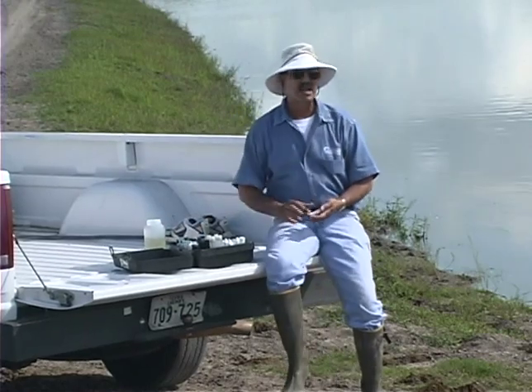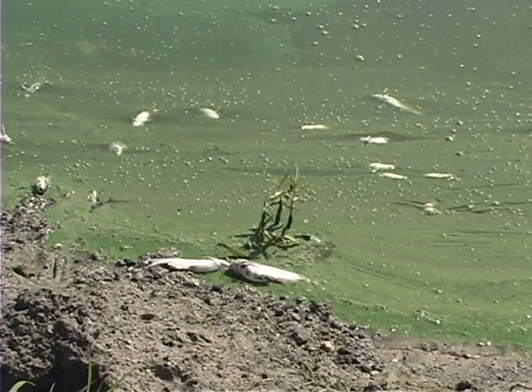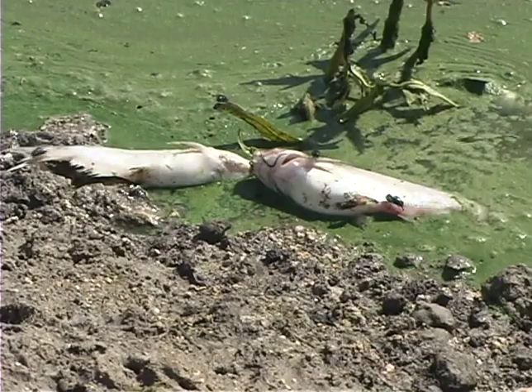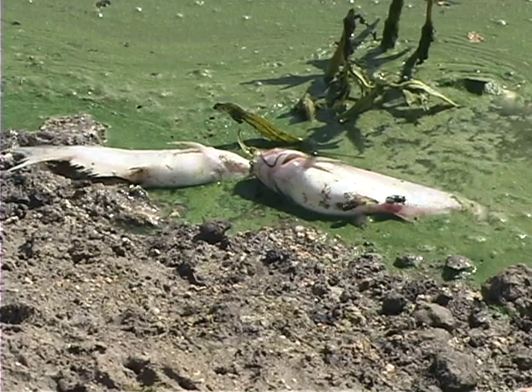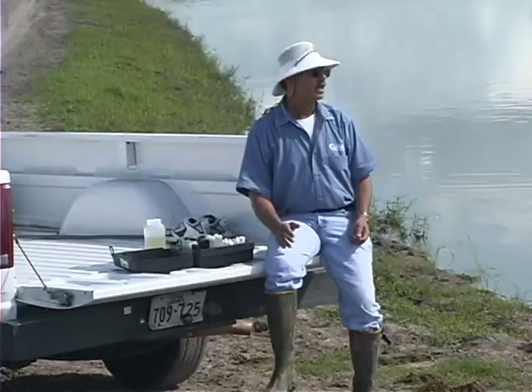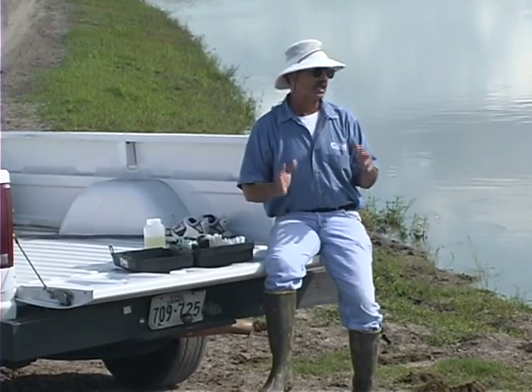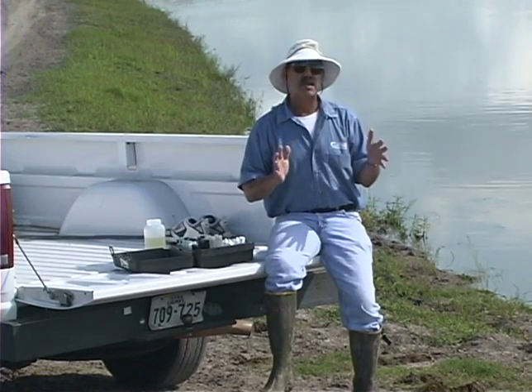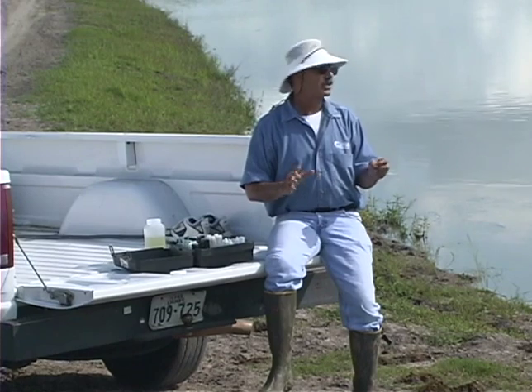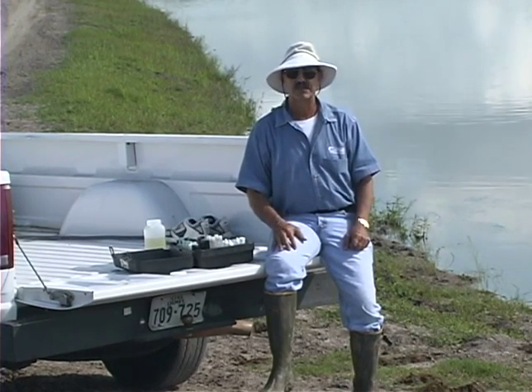As you can see behind me in this pond, we've had a fingerling die-off overnight, and we've also got an accumulation of scum on the surface of the water, indicating that we might have had a phytoplankton die-off recently. One of the problems with a phytoplankton die-off is that we very frequently end up with a high ammonia concentration in the water afterwards. So the first thing we're going to test for this morning will be total ammonia nitrogen.